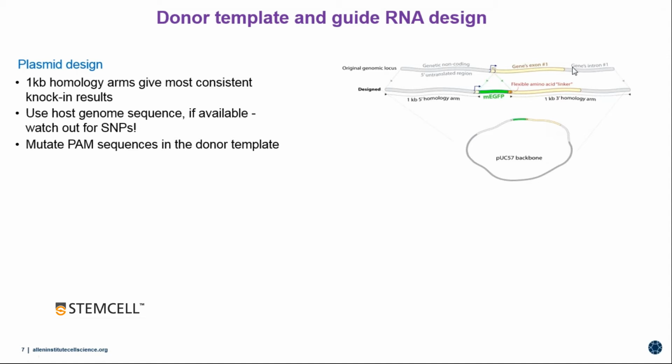We do introduce sequence mutations into the PAM sequence in the donor plasmid so that the plasmid does not get cut before it can do its job. So those are some lessons we've learned, and we've incorporated them into our editing process.